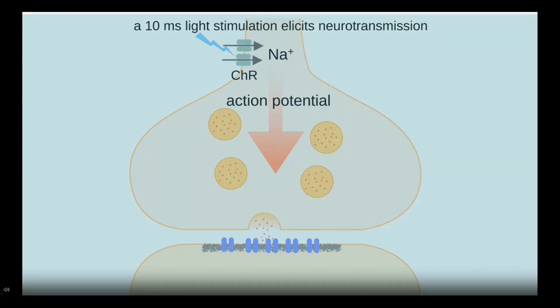And then at exactly the time point you want, where you think you're going to see the thing you want to see, you freeze the cell, immobilize it immediately. And then once it's frozen, everything is frozen in time essentially forever. And then you can go look at what it looked like in that instant by electron microscopy.